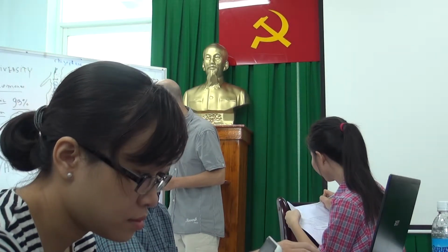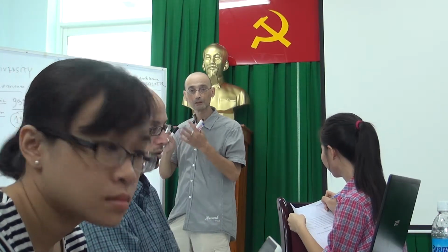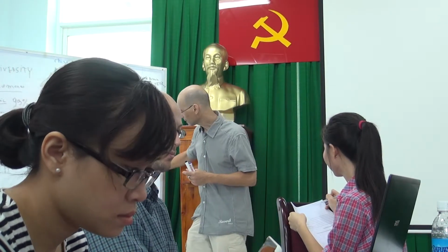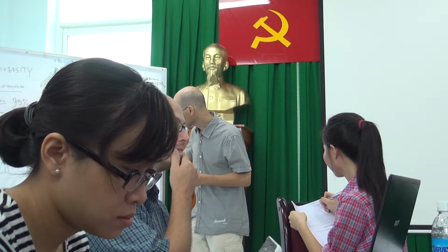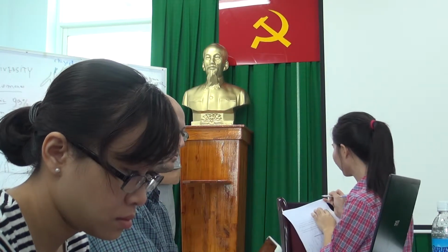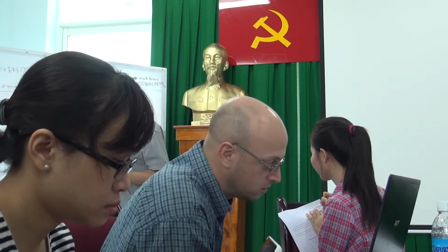Colony forming unit. The idea why we call this colony forming unit in cells is that this is supposed to be what we're counting here. We think we're counting the number of cells in the original samples, but we're actually not doing that exactly, because our assumption is that when we plate here, each colony will grow from one cell, which will divide and grow to form one colony.